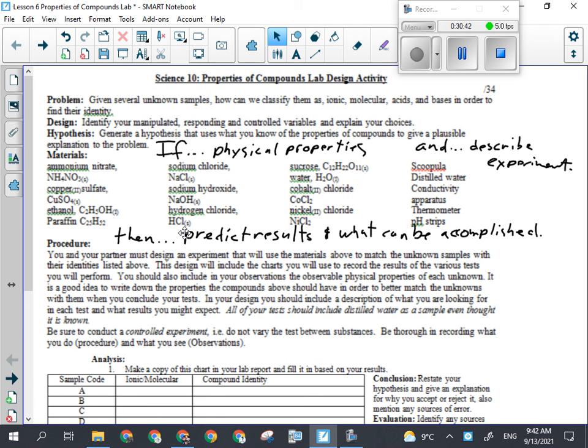So I take that and put it in here. What's it reading? 1. Why? Because this is distilled water. Distilled water has basically no conductivity. Now, what do I do with it now? Rinse it. Imagine I rinse. Okay, so it's rinsed. If I have a solution that is an ionic compound, what should happen? Conductivity should go up. Yeah, exactly. All right, so I just put a little table salt in there.